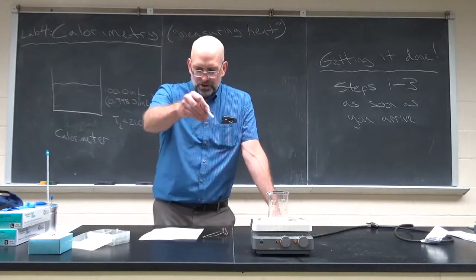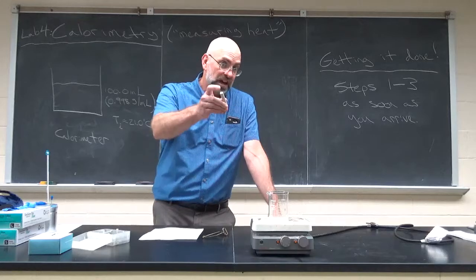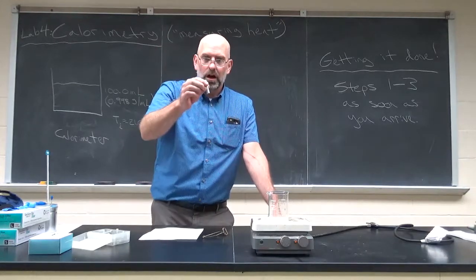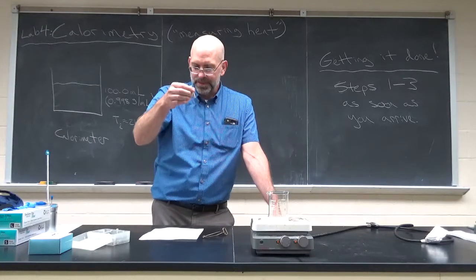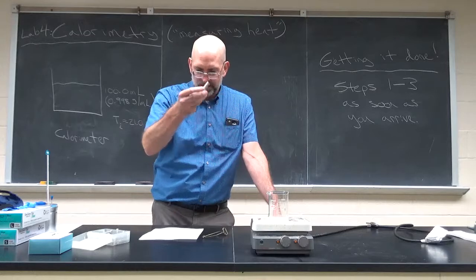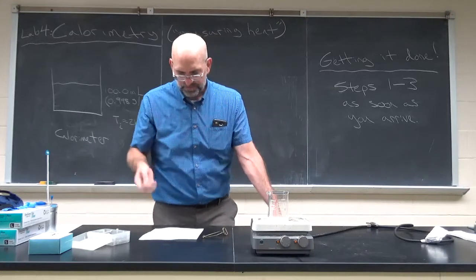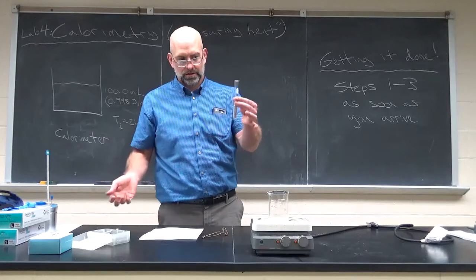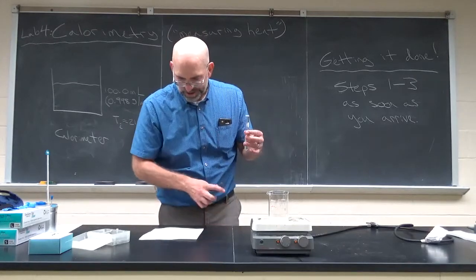Record the mass of an aluminum cylinder and describe it, kind of like you did before. So make sure you get one of these. I'll probably have these laid out. Record its mass. You know how to do that. All the significant digits. Record what it looks like. Place the cylinder in a large test tube. Do this carefully so you don't smash it. Okay, that goes in there.